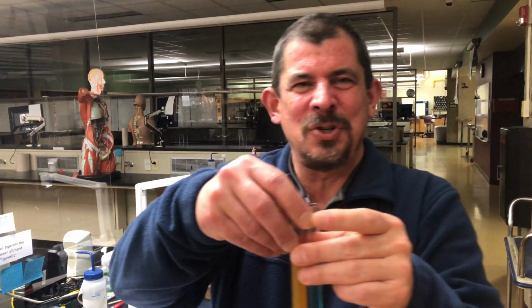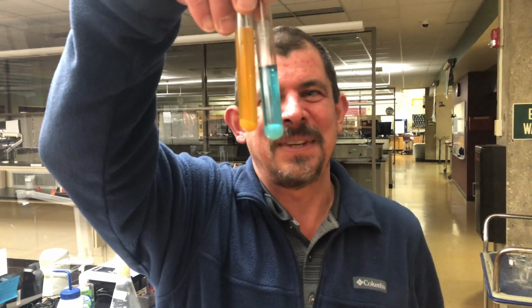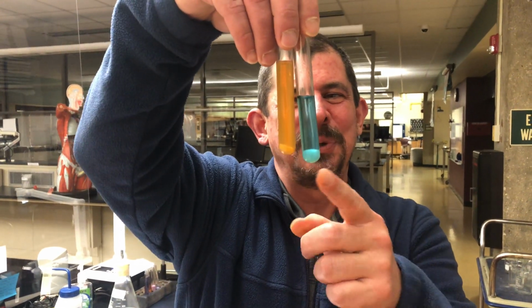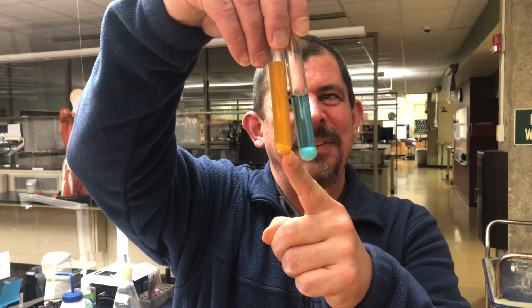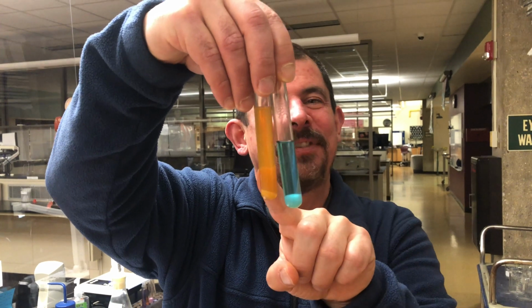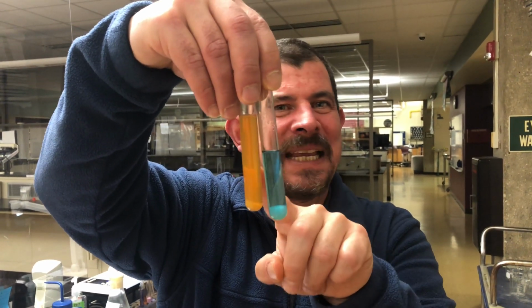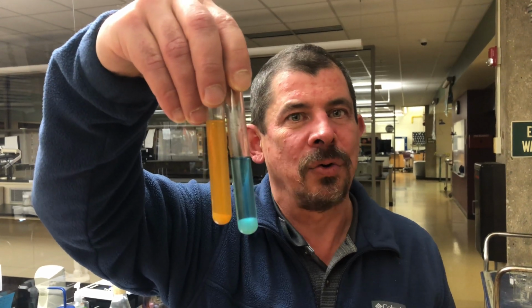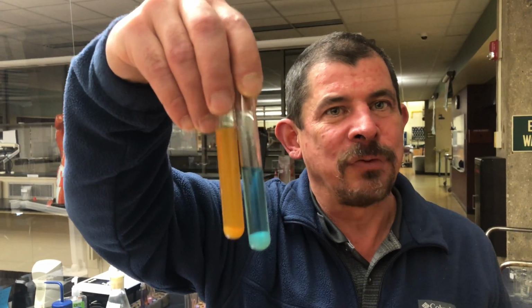We would get 2 tubes that look like that if we stuck them together in the water bath. One would remain blue, the other comes out an orangish color. You can even say a red, a green, a yellow. There will be some significant color change after we put this into a warm water bath.